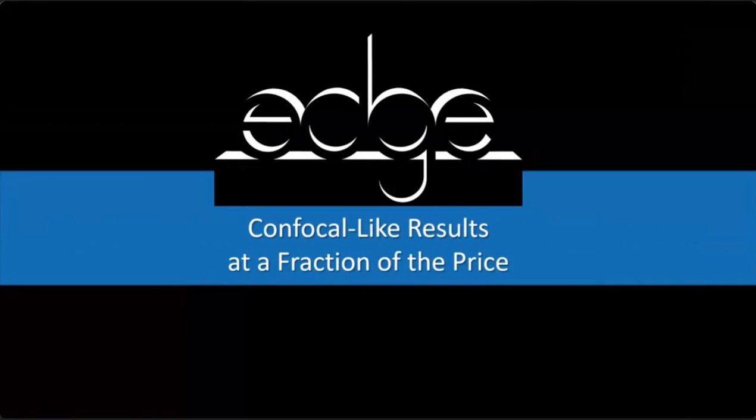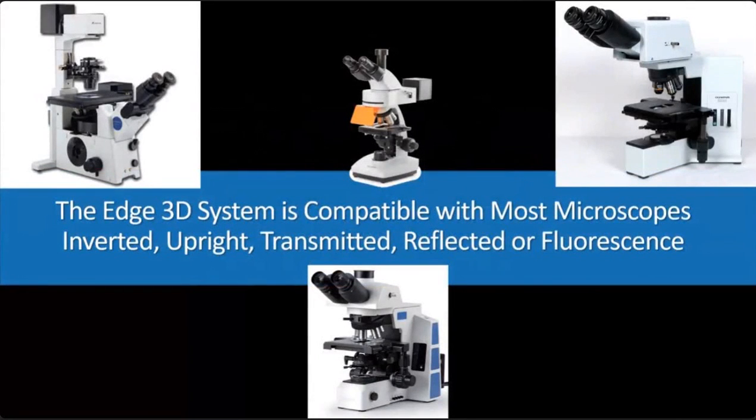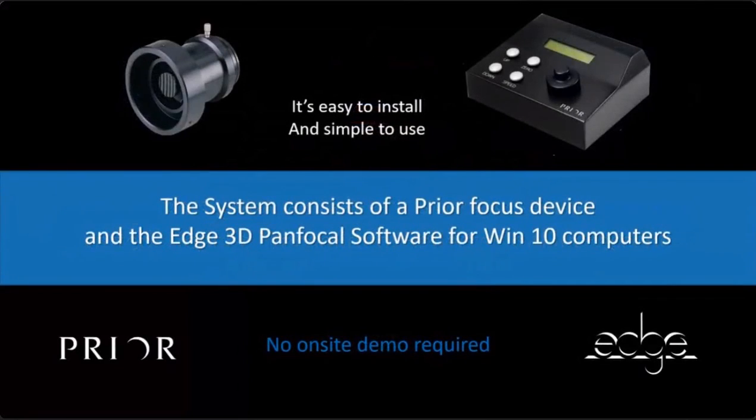It gives you confocal-like results at a fraction of the price of buying a confocal microscope. The Edge system is compatible with almost any light microscope: inverted, upright, transmitted, reflected, fluorescence. So it's very easy to adapt to your existing 2D microscope. It's easy to install and simple to use.